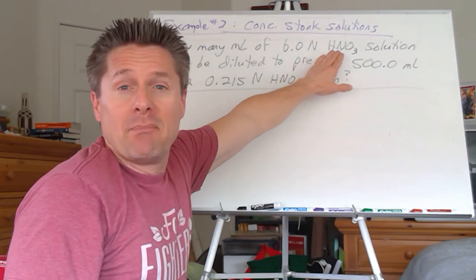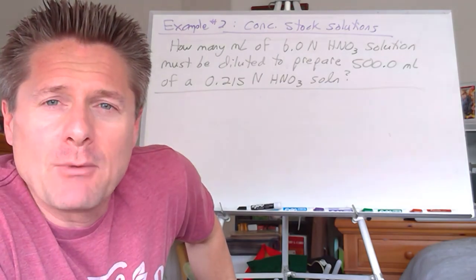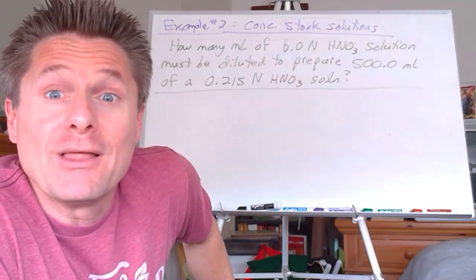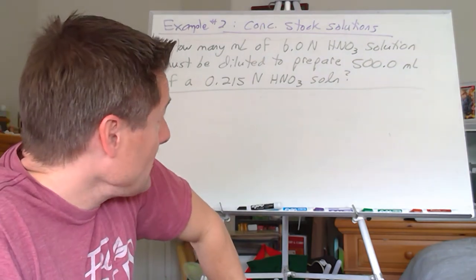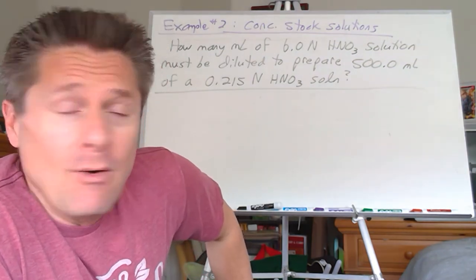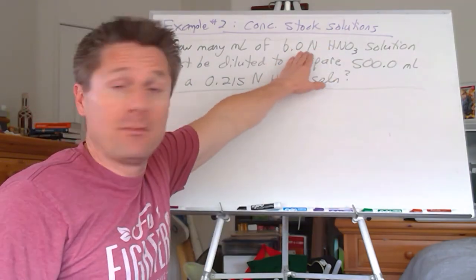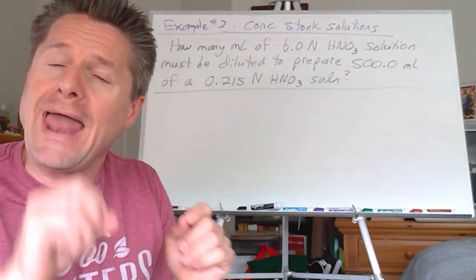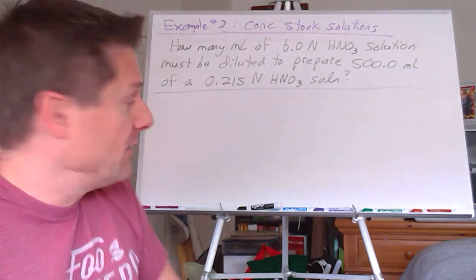And you'll see these quite a bit back in the old days with acids, right? Today it's mostly molarity, but back when I was younger, we saw a lot of normalities on the actual bottle labels, common for acids and bases. We immediately know, hey, this is not a solid. This is a concentrated stock solution. So what volume of that do I need? And we're going to probably measure that out using a burette or a graduated cylinder in milliliters.